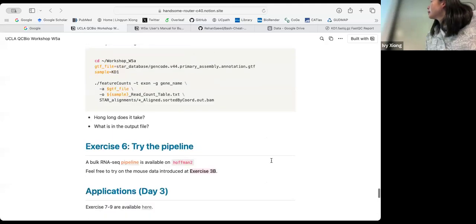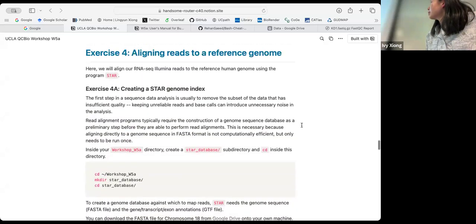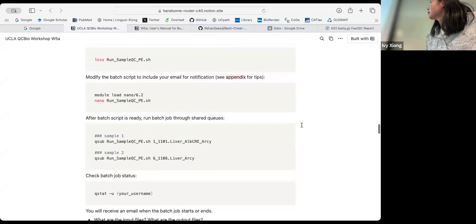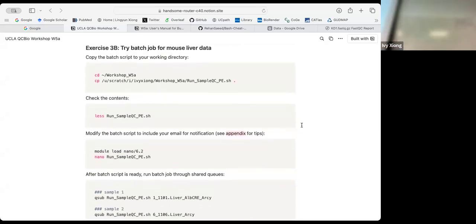So yeah, let's try 3B. And that's about all the content that we have today. One thing. If I put everything on the system, I'm good to go, right? It's on the system, it's running. Yeah, perfect. So we can see the result tomorrow.